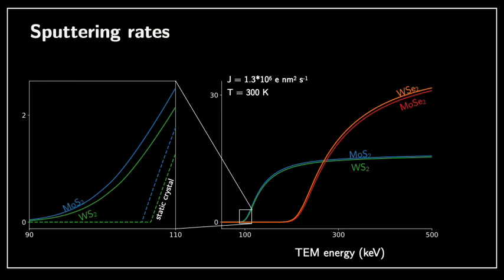However, the nice thing about this work is that it confirms that experimentally, when you increase the temperature, you do indeed increase the sputtering rate. And in fact, very many papers have reported that it is the combination of temperature effect and energy of the electron beam that can allow you to work very closely to the sputtering type that you want to have. So this is good. So this is the temperature effect. It's not enough to explain the discrepancy, but it's enough to help a little bit in having a full description of sputtering. Okay, so clearly temperature effects cannot account for the discrepancies.